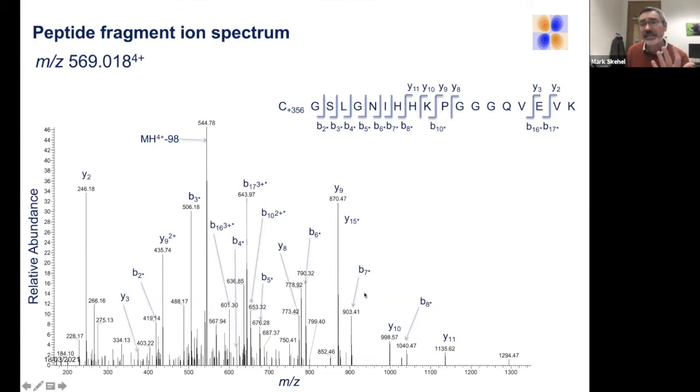It carries out a pattern recognition process to marry up the precursor ion mass and the fragment ion data with a peptide sequence. It's a bottom-up approach: by identifying the peptides, we infer the presence of the protein.